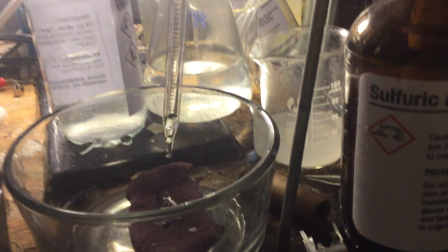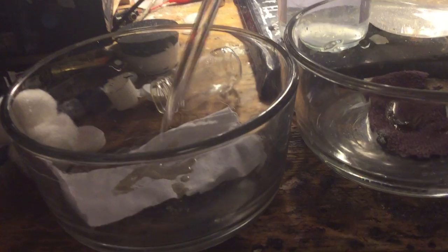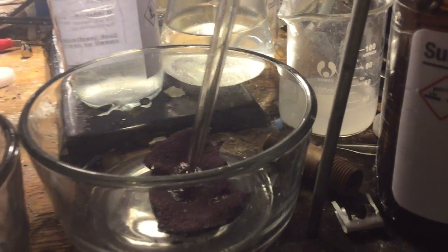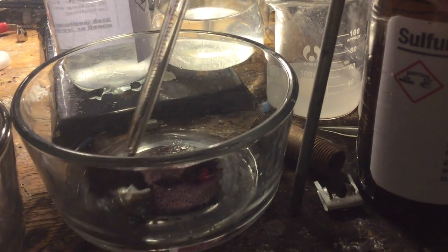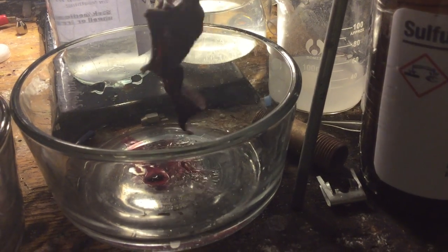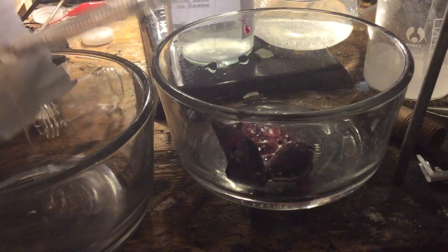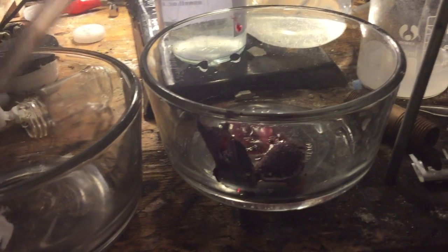As you can see, it's already starting to change color. And this lab coat has become charred. And this one, as you can see, it has dissolved into a goo already — it's dissolved basically instantly. While the pure cotton lab coat is still pretty much okay. It hasn't dissolved through yet.